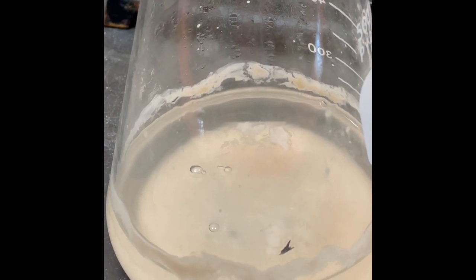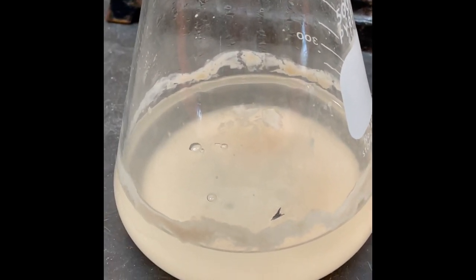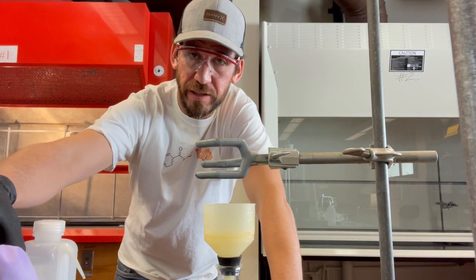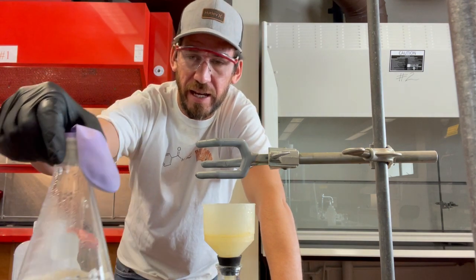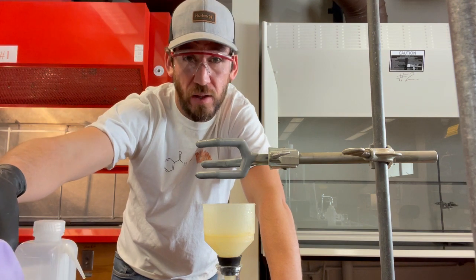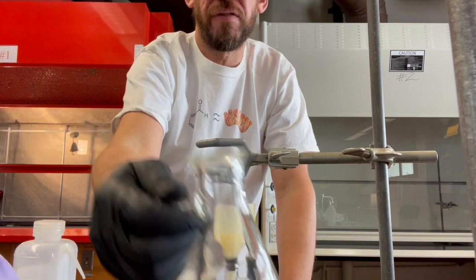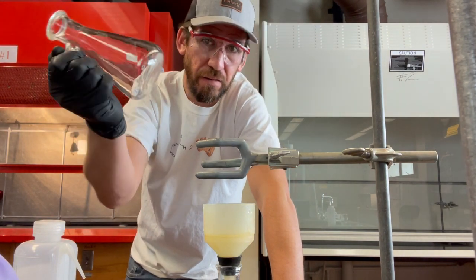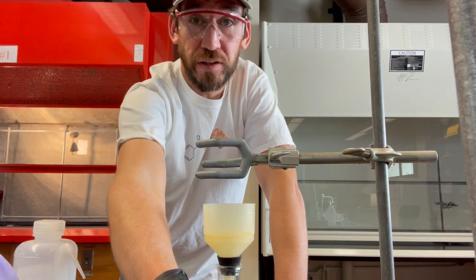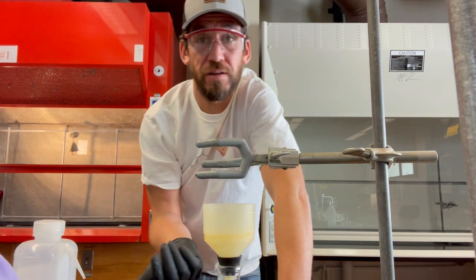What I want to do here is filter this and then take some and do a fractional distillation. So I want to take care of this guy. I want to transfer all of the liquid, not the solid material on the bottom. I'm going to filter it and put it inside a vacuum flask that is clean. You want to make sure it's clean because we're using that material. We're going to distill it, see how much ethanol we can get out of it.